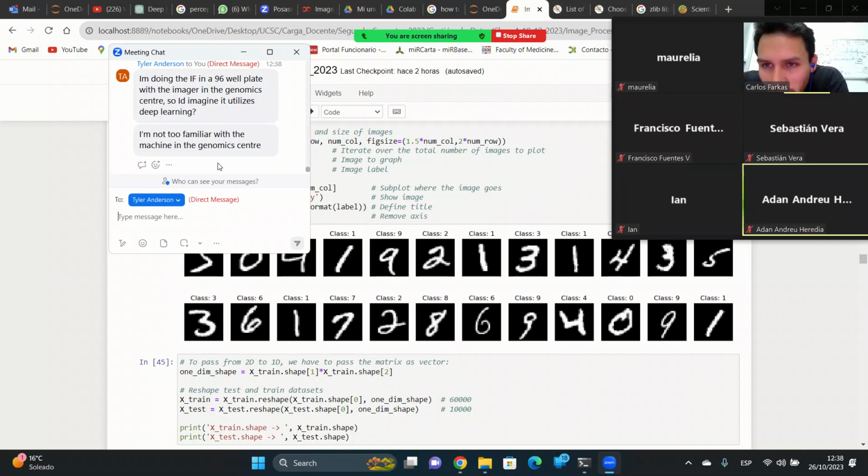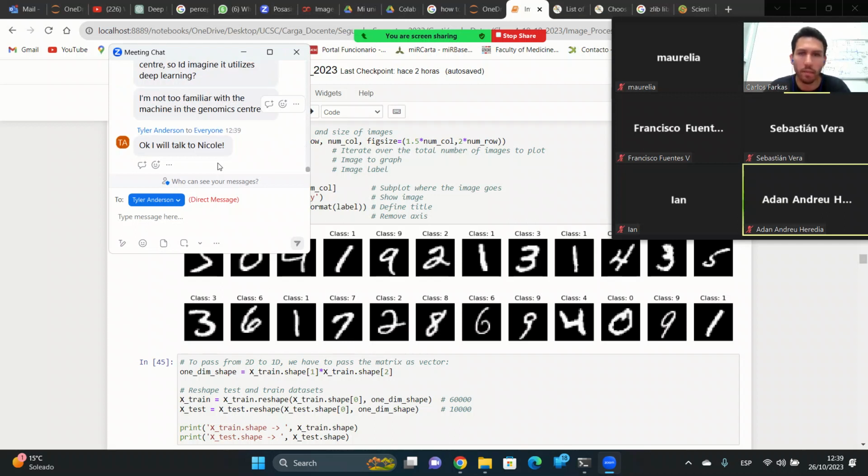And then the immunofluorescence and access with imaging, genomics, and deep learning. And if you have fluorescence, if Tyler can give you a set stack or something with fluorescence, or the image in a certain format, we can work on that. That's good. As long as they give you the raw data, it's good. So you can send me that for training purposes, and we'll load it on Python. And if you have something interesting to see, better images, please let me know and send me one picture, and we'll see what we can do from there.